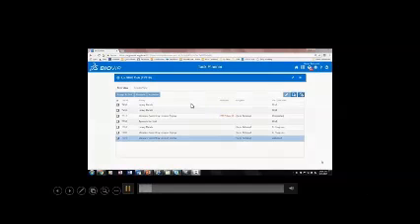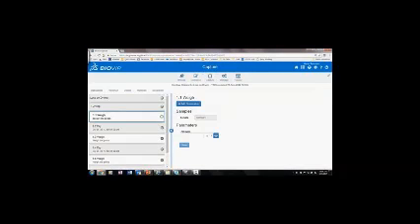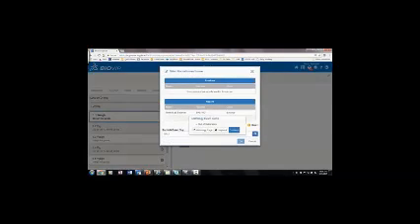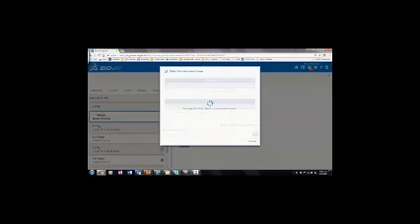This is a very short video, but in the lab, I have my request to run a loss on drying. I click on it on my tablet. I press the button over here to collect a weight. I click on my balance. It tells me it's out of calibration. So right off the bat, I know it's out of calibration. I can't use it. So I'm going to pick a different balance. I collect. It tells me it's calibrated.